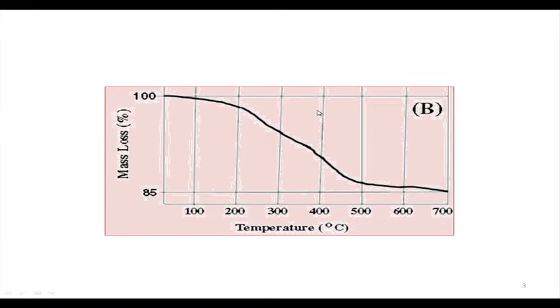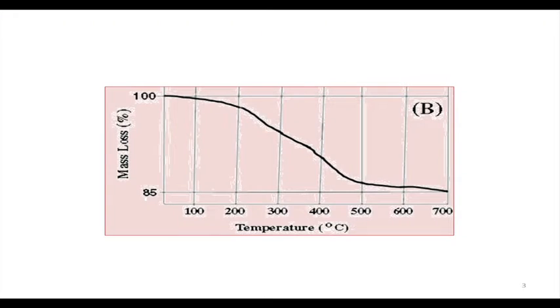Hello, welcome back. So, we are discussing the degradation process of calcium oxalate, and how the corresponding weight loss can take place. This is a very simple plot of all these TG experiments. You make the corresponding sample of calcium oxalate and put that particular sample in the instrument.